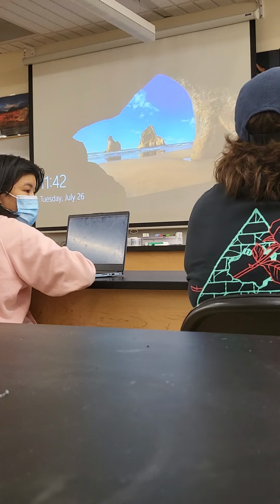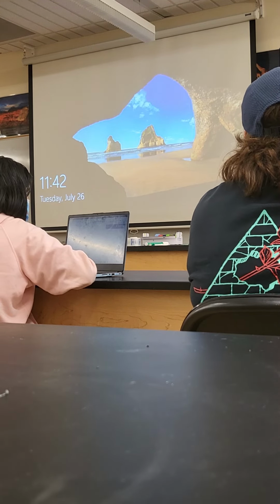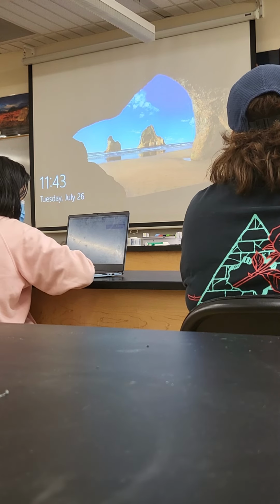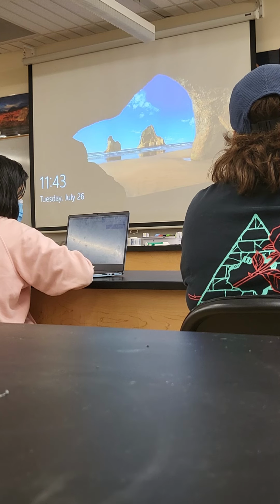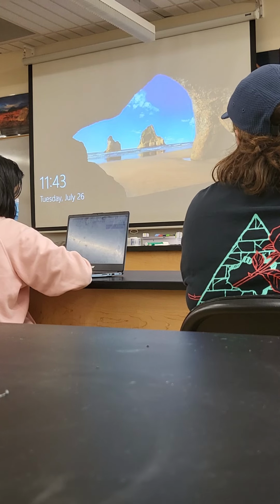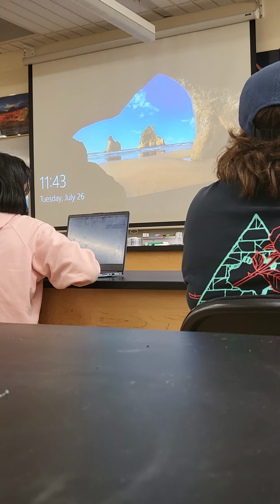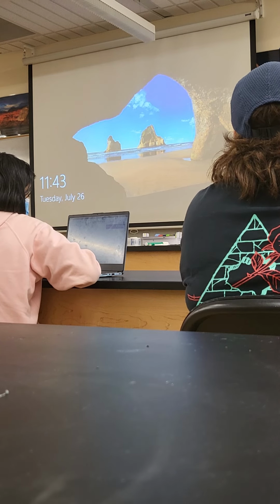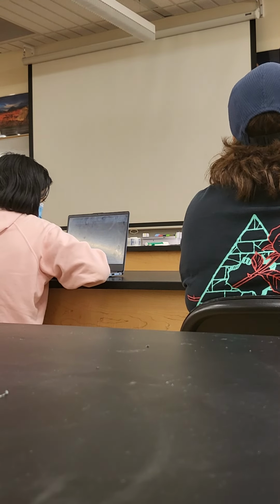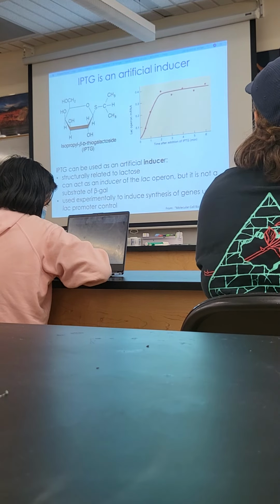Are we synchronizing the development of the worm? That's a great question someone was asking. That's a common way to do it, and it is effective to get a whole population of worms at the same stage. But the bleach synchronization itself is a little tricky. So I just set them up so that you will have the right stage there, and I checked to make sure that we do have the right stage. So we're not gonna do the synchronization step. If you were doing a longer project, I think it's another skill to learn, but for this, we don't have a ton of time this summer.